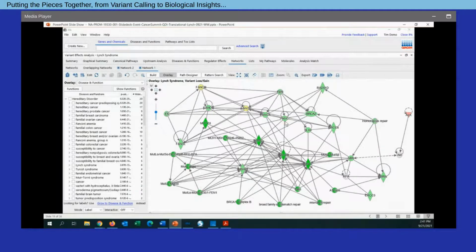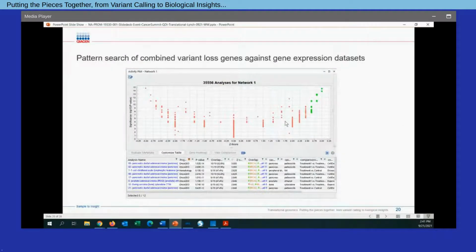Now, with this information, we can take this pattern of loss of function in these genes and utilize what we call analysis match in IPA, employing 90,000-plus comparisons from public studies that focus on gene expression to ask the question: in what studies do we see gene signatures that show a similar loss of expression of the same set of genes I just showed in my network? To do this, we utilize something we call the activity plot.